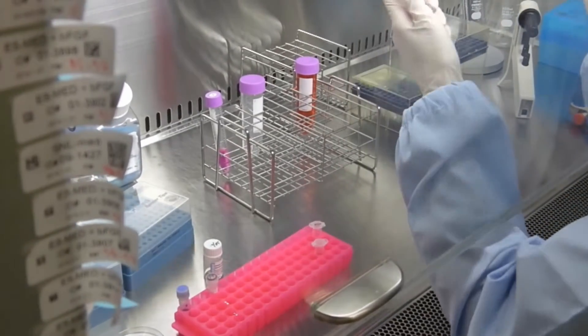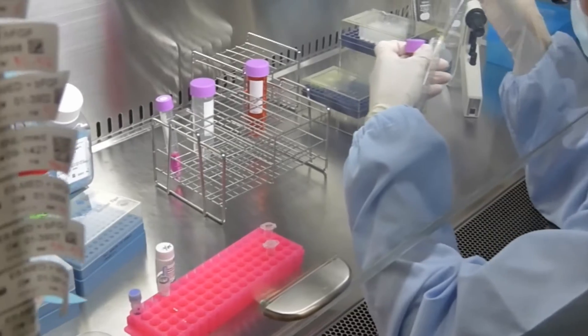After centrifugation, the supernatant is removed by aspiration.